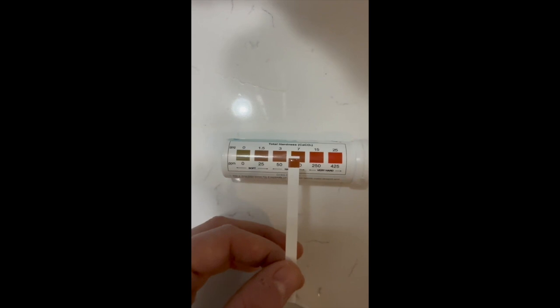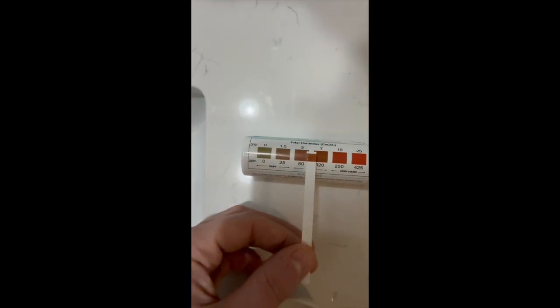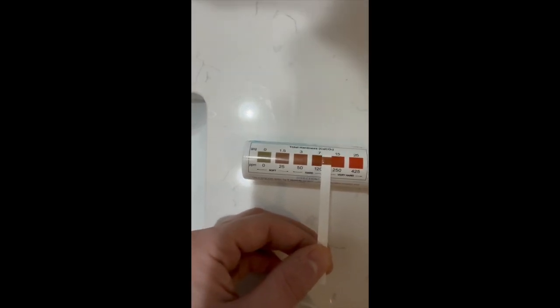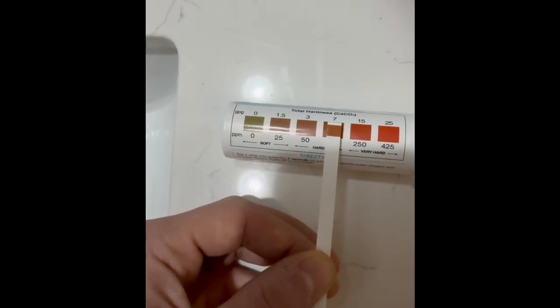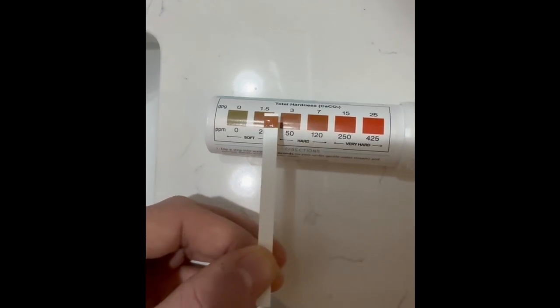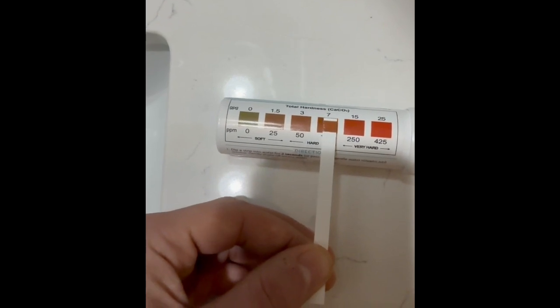Once it's been 30 seconds, you want to run it up against the chart on the side of the bottle that shows the different colors going from soft to hard. Then you just want to match it up. For us, I think we're right here on the 7 GPG or 120 ppm. It says if you're in between a color, to just guesstimate in the middle.